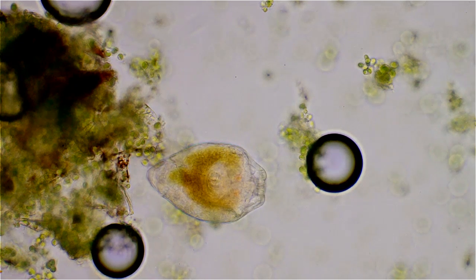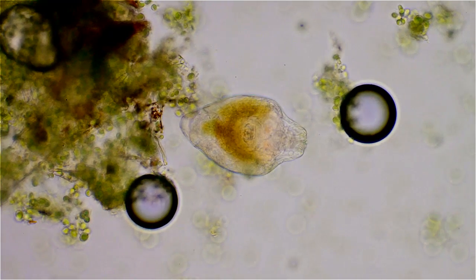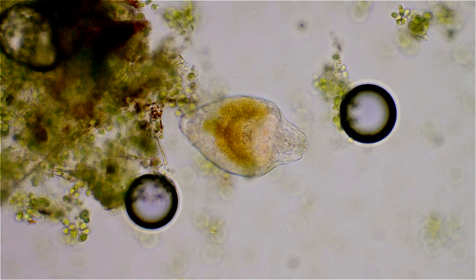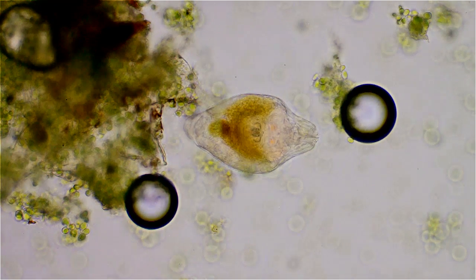This is going down to 20x to give you an idea of the size. Those two black things are hair bubbles, and all the green stuff is some of that algae.